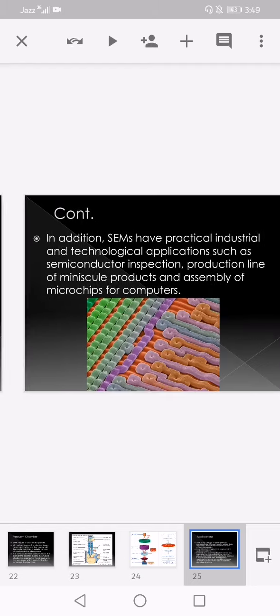Applications. SEMs have a variety of applications in a number of scientific and industrially related fields, especially where characterization of solid material is beneficial. In addition to topographical, morphological, and compositional information, a scanning electron microscope can detect and analyze surface fractures, provide information on microstructures, examine surface contaminations, reveal spatial variations in chemical compositions, provide qualitative chemical analysis, and identify crystalline structures.